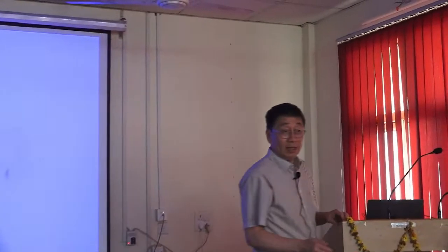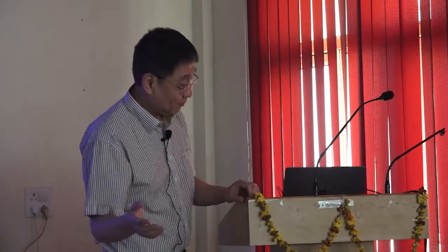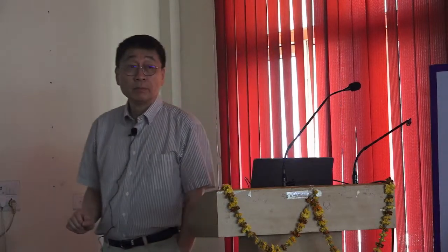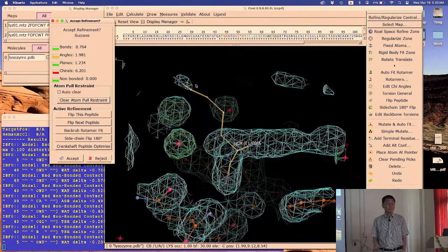So, did you have luck dragging things around? Were you able to fit it in? No? Okay.